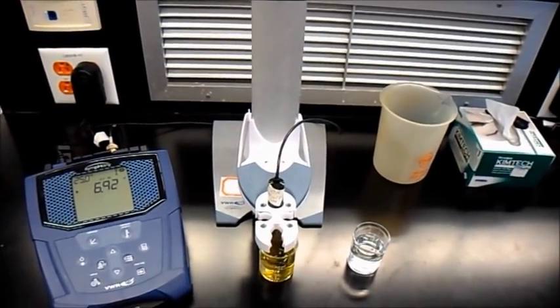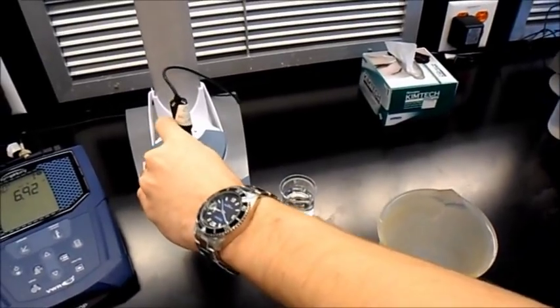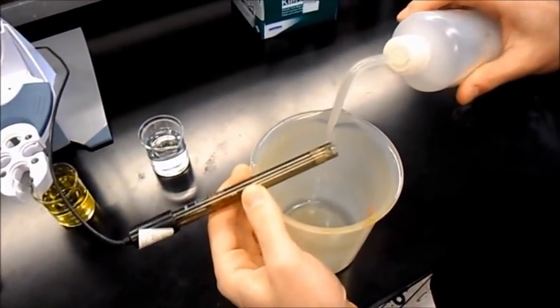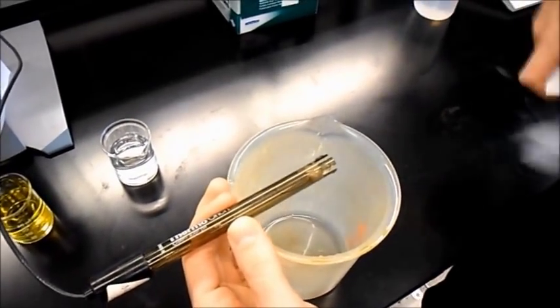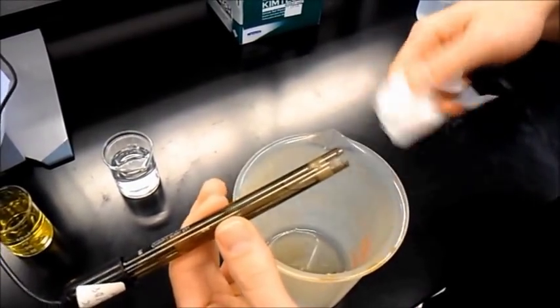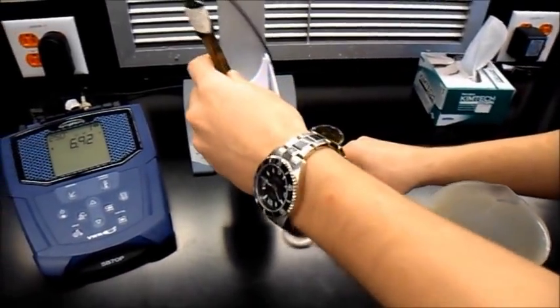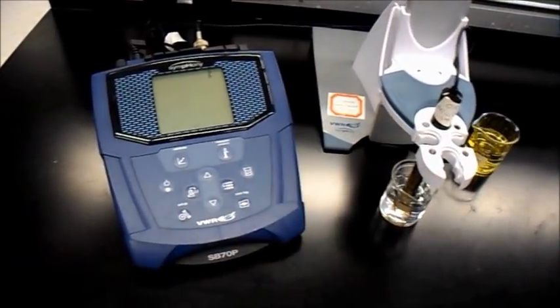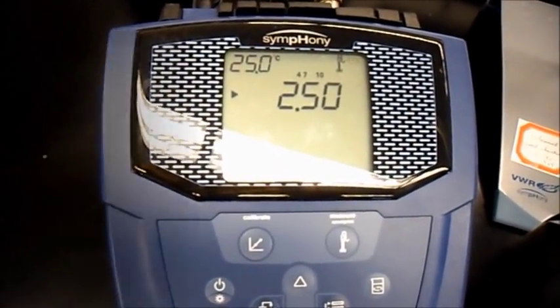This meter does not automatically record pH. To test a solution, rinse the probe and dab it dry. Then place the probe in your solution and hit the measure button on the pH meter. The meter will lock in its final reading.